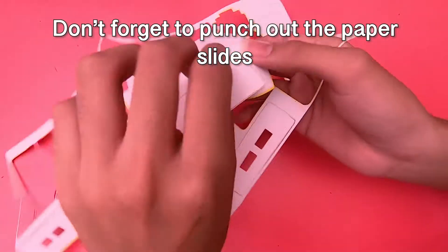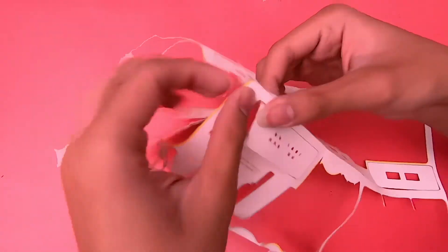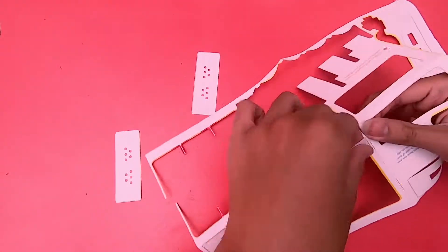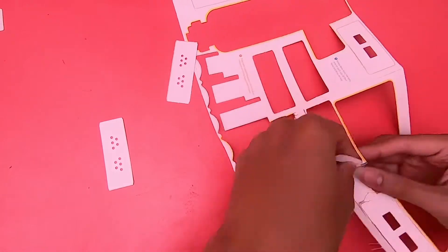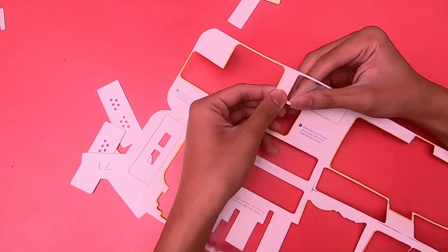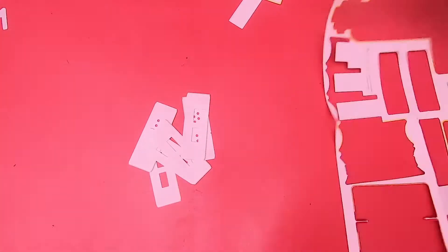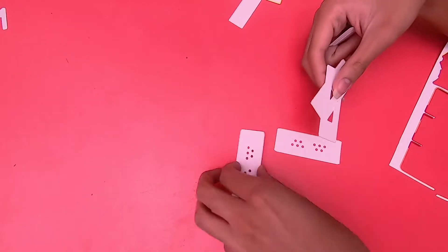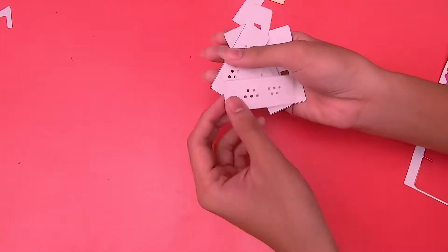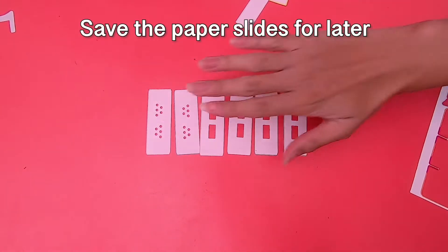Don't forget to punch out the paper slides. We'll save the paper slides for later.